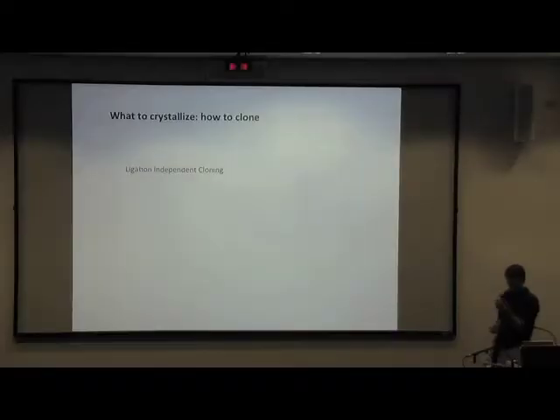So the fact that you have all these restriction enzymes, and when you look at them, the expiry date is 2004. It just doesn't work. So we've been using a method that relies on a single restriction enzyme and a single enzyme called T4 DNA polymerase. And maybe many of you are familiar with it. I had a cartoon, but I lost it. But it's very simple.